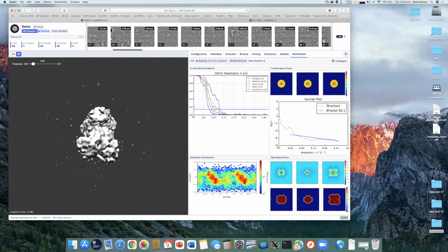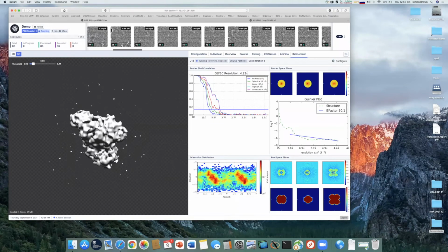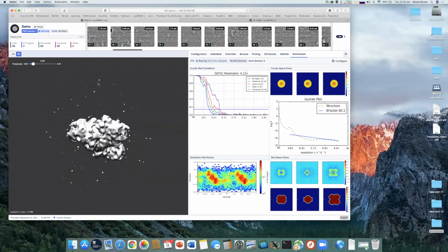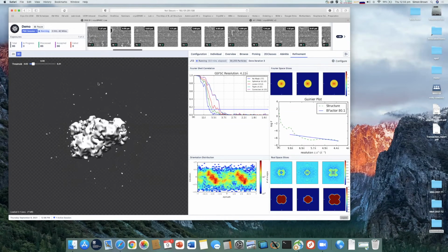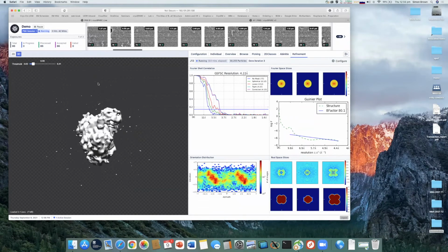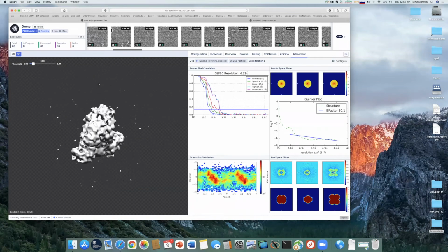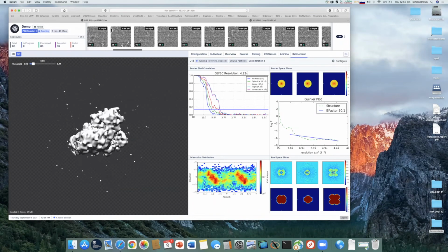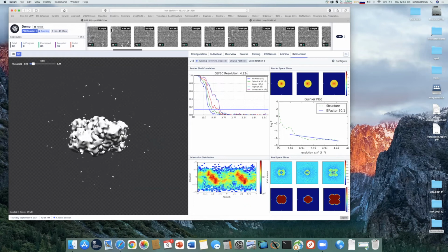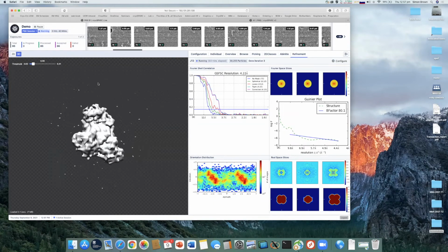We originally purchased hardware from them, and James and Simon had put me onto them as a group, and the hardware came with a support package for the software on the machine. Single Particle have since clarified that they provide the support independently, irrespective of whether you've purchased hardware from them or not. For about $1,000 US a year per machine, they'll support the application.